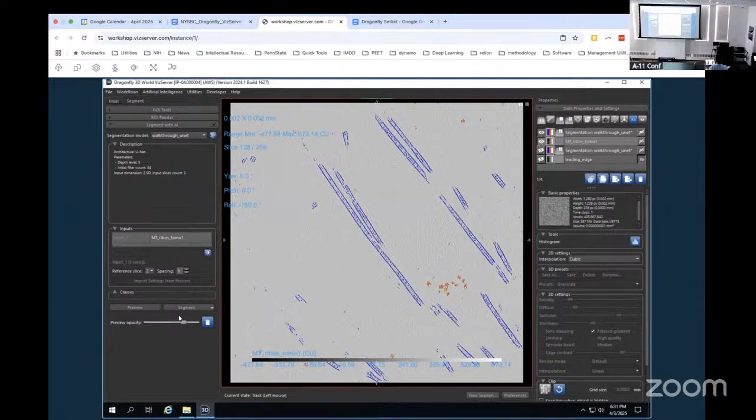Look at how nice. We have some things. These are like membrane, like SER. It's finding pieces of membrane that are close together. It's a good network. It's also getting the edge of the carbon, but it's mostly working.